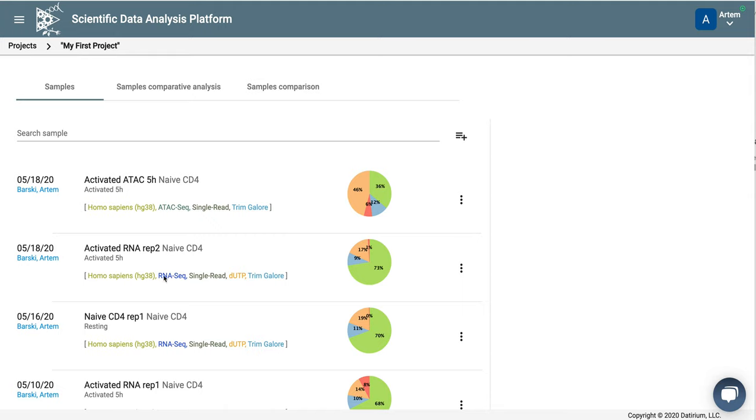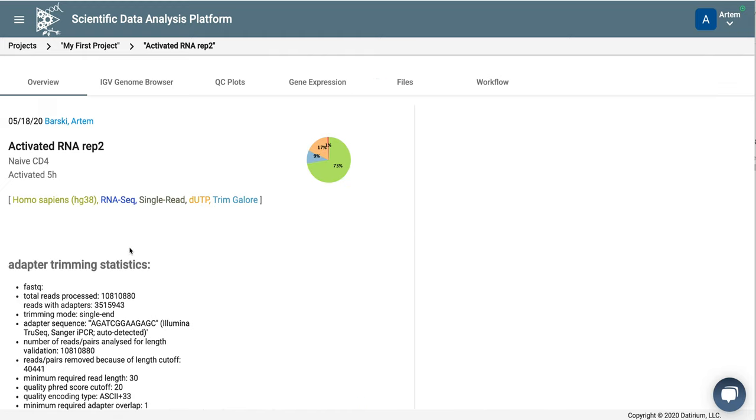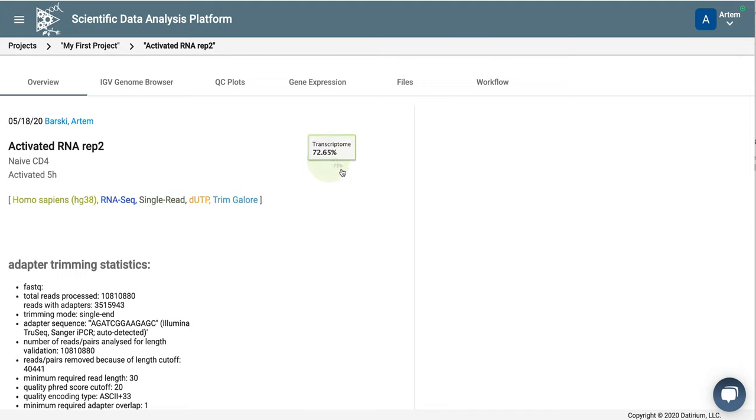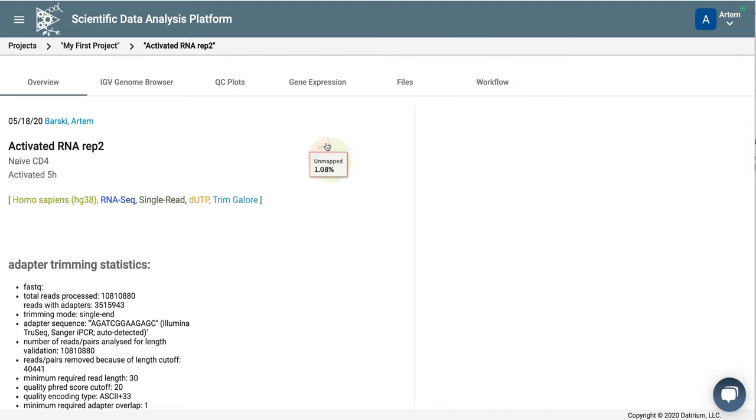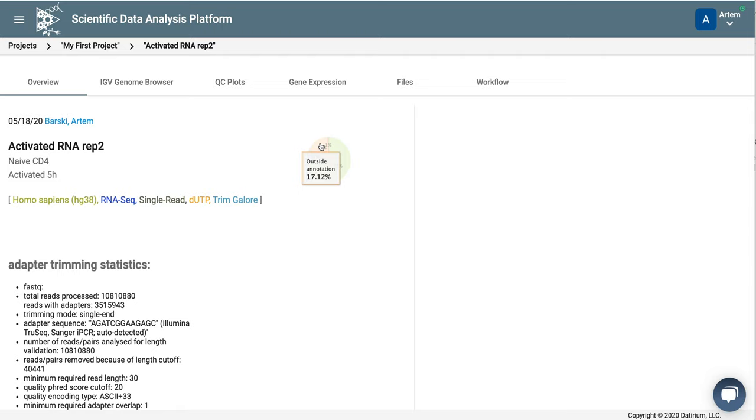So this is one of our RNA-seq experiments. Let's click on it. We can see here that the mapping was pretty good. You can see mapping is about 72% to transcriptome, which is great. There is a relatively small number of reads that are not mapped, and there are also reads which are mapped outside annotation.